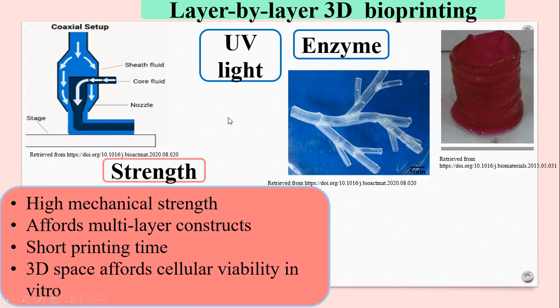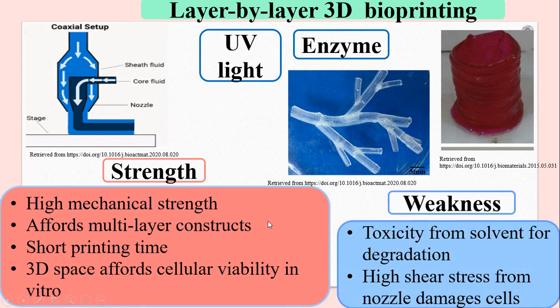The strengths of this technique are high mechanical strength, affording multi-layer constructs, short printing time, and a 3D space that affords cellular viability in vitro. The weaknesses of this approach are toxicity from the solvent for degradation, and high shear stress from the nozzle, which damages the living cells.